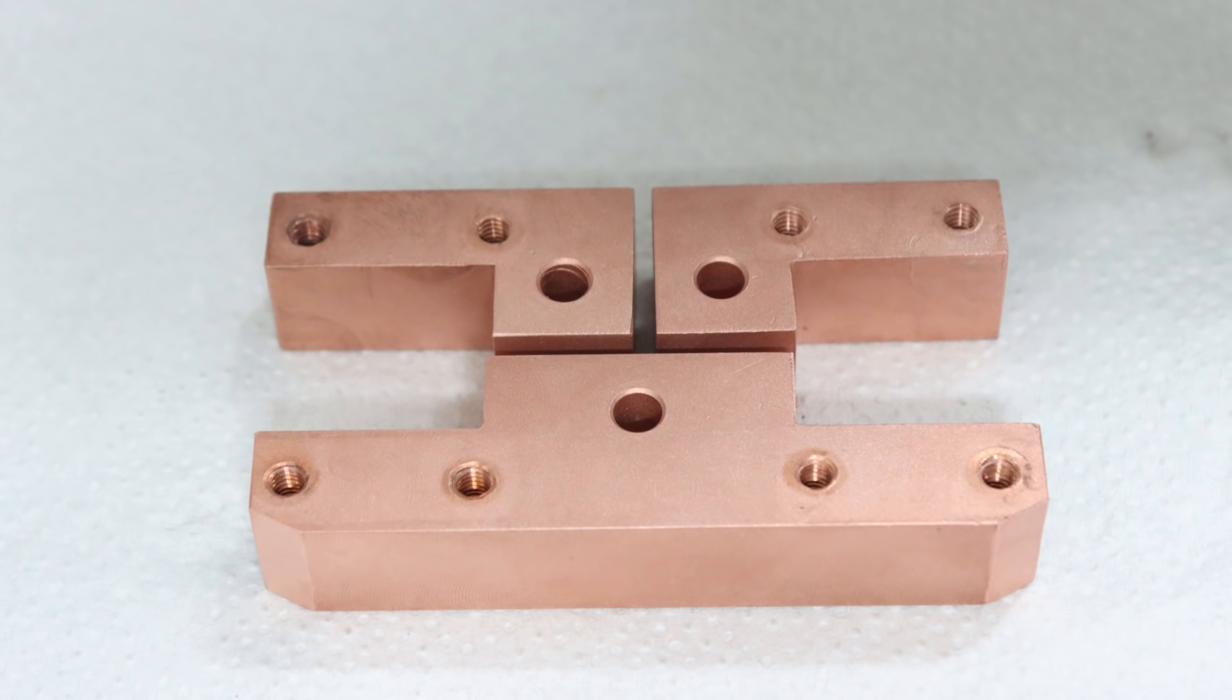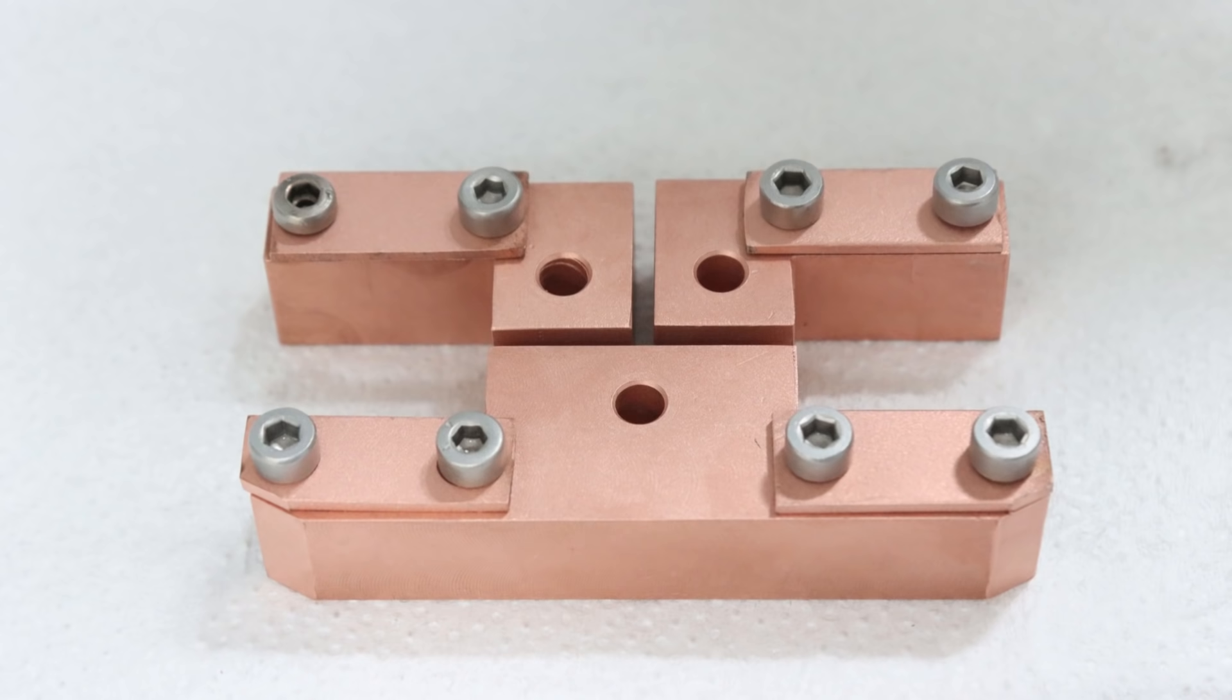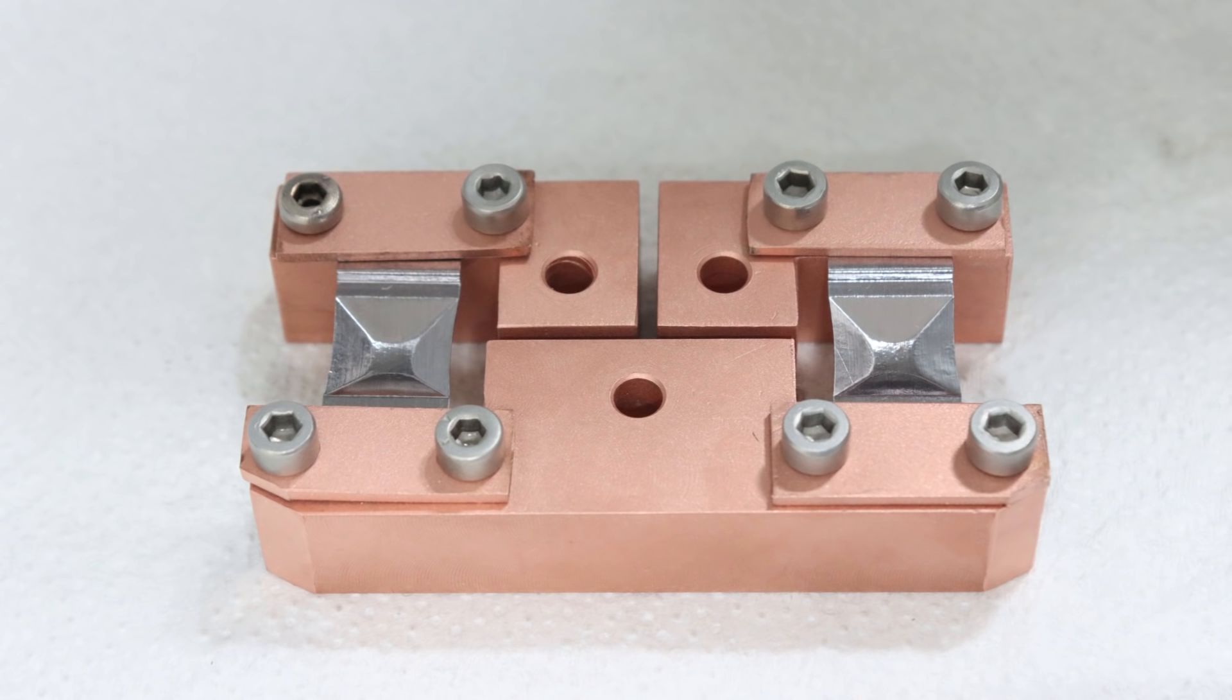The currents needed in thermal evaporation to heat up the boats are pretty substantial, generally above 100 amps. You therefore need a very good electrical conductor to connect the evaporation boats to the current source. But good electrical conductors like copper are also very good conductors of heat. So you need to cool the contacts, otherwise your setup will just melt after a while.